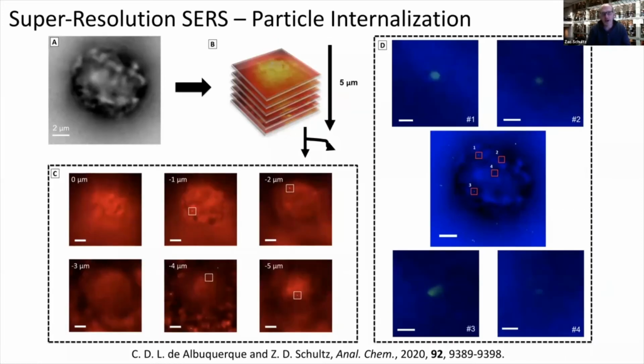So using this now, we're using this to study how nanoparticles are interacting with molecules as they move into cells. We want to follow the fate of these receptors. And some preliminary data in this direction is shown here, where what we've done is we've taken slices in different focal planes as our nanostars have interacted with the cell, so we can kind of get an idea of internalization and potentially different chemical actions that occur with that.